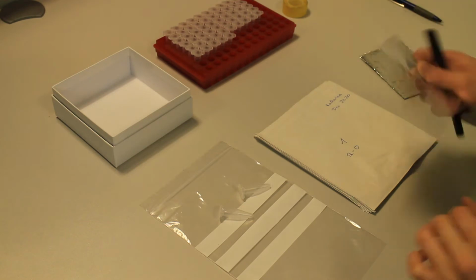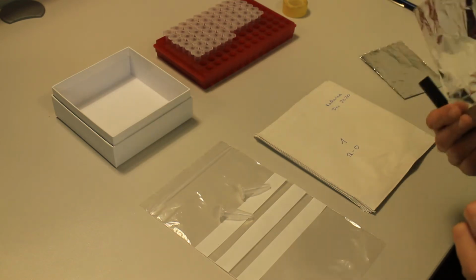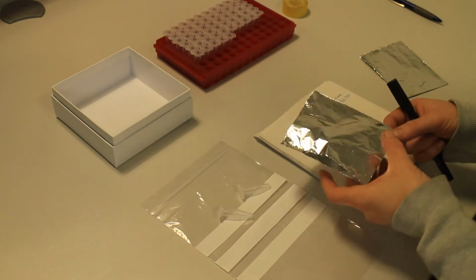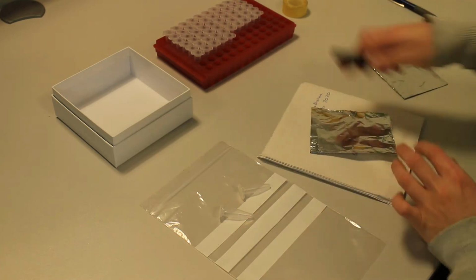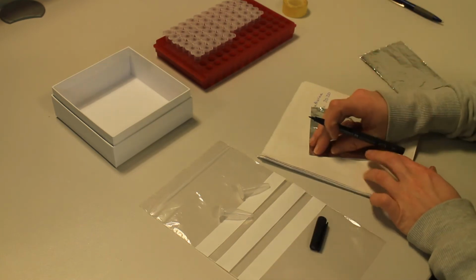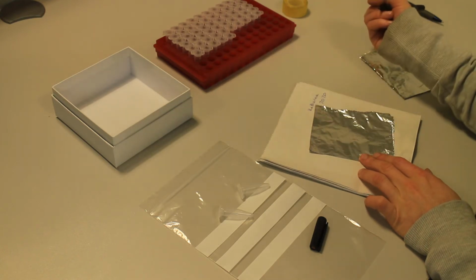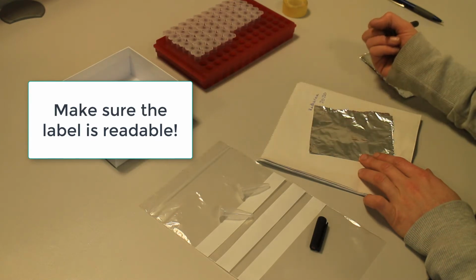For these little tinfoil bags that I've prepared, I'll put plant material in there to immediately freeze in liquid nitrogen. So I'll have to fold the edges a bit, so make sure that you label them somewhere where it's already folded and you can read it afterwards, because there's no use if you fold it and then half of your label is gone, right?